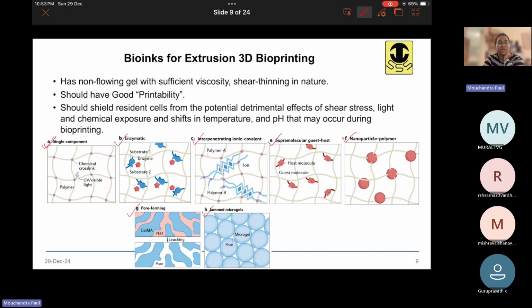Right? Microgels. So you can first cross-link a hydrogel, then do some sonication, or mechanically grind it through sharp blades, in order to create microgels, meaning gel pieces of very small size, like micron-sized gel pieces. And that complete mixture of just cut-up gel can be used as a bio ink.